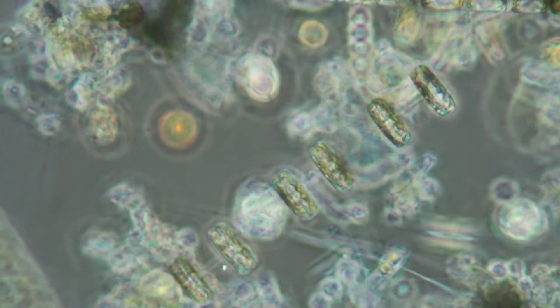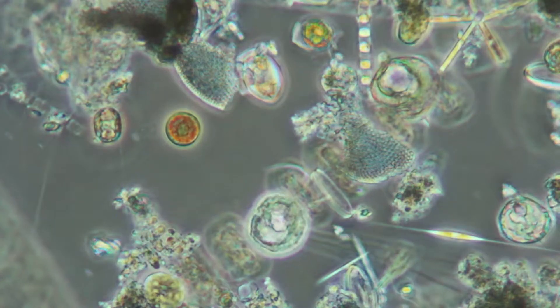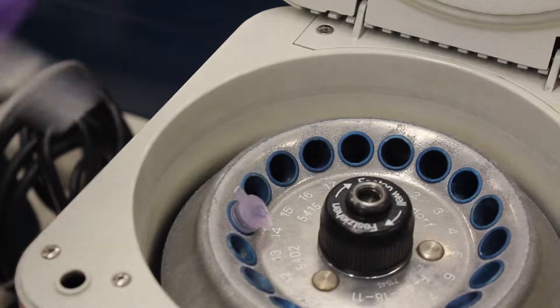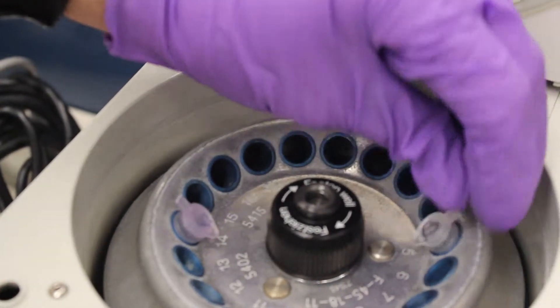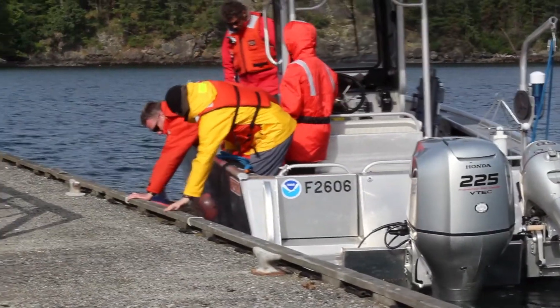We use this assay for heterosigma because we can find out if they're in a water sample even if they're not concentrated enough to see under a light microscope. Heterosigma tend not to preserve very well, so if we take a live sample of seawater and concentrate it right there and do our DNA extraction immediately, we'll be able to see if heterosigma are in the water.